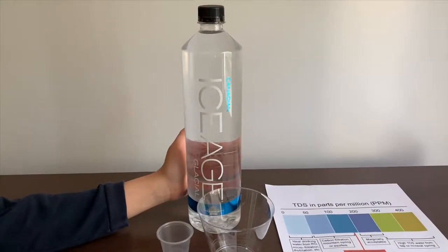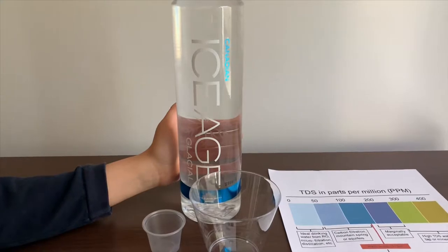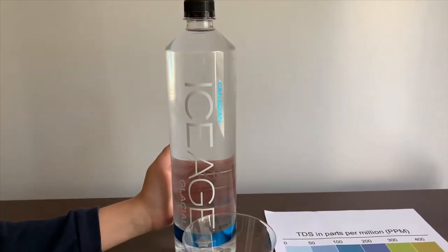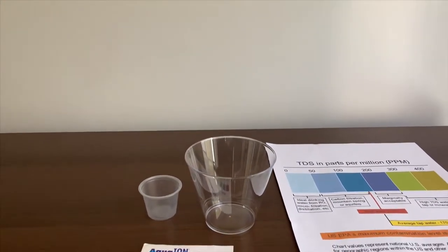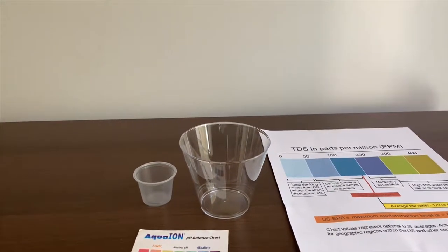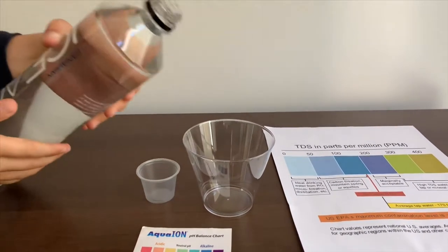This is Canadian Ice Age glacial water. It costs $1.99 and is sourced from British Columbia, Canada. Let's test the pH and TDS levels. Let's pour some water in.